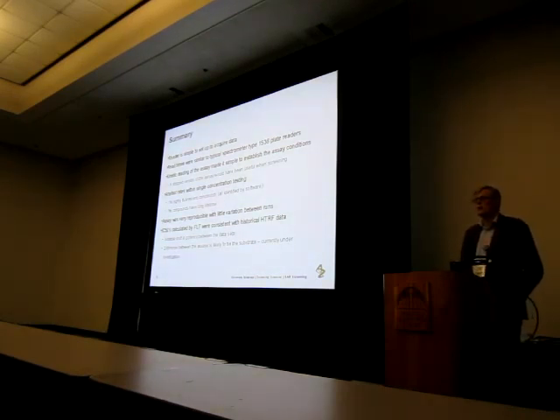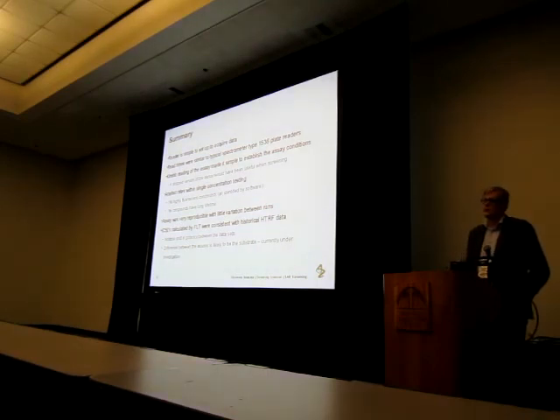And at the moment, obviously, with the exception of the detection technology, the only real difference, we suspect, is really around the substrate that's being used. As I mentioned earlier, the reagents that are going into the assay are pretty much the same, whether it's an HTRF assay or the FLT assay. The difference is probably going to be substrate. We understand what the substrate is from an FLT perspective, but at the moment it's not clear to us exactly what the CisBio guys are using as a substrate in the HTRF assay.